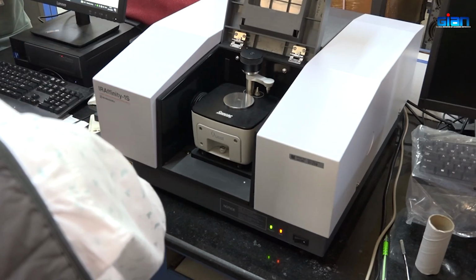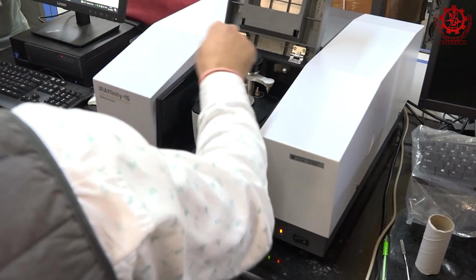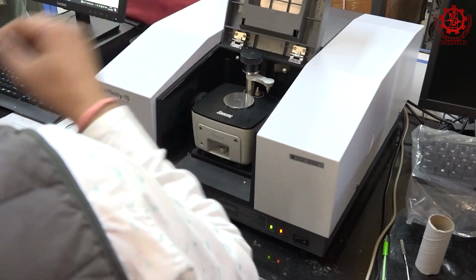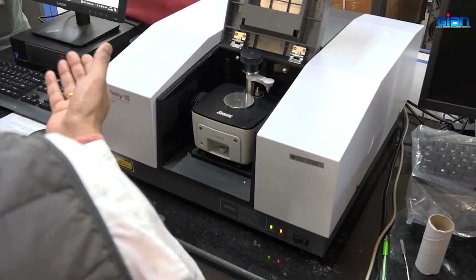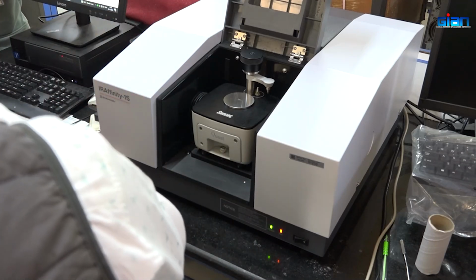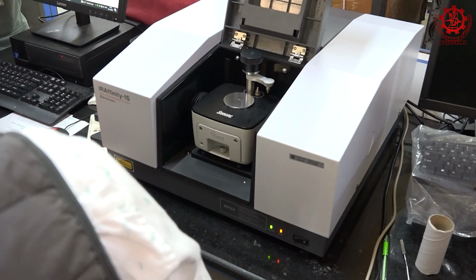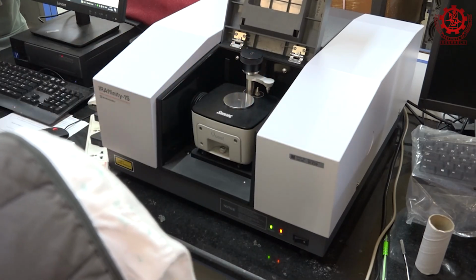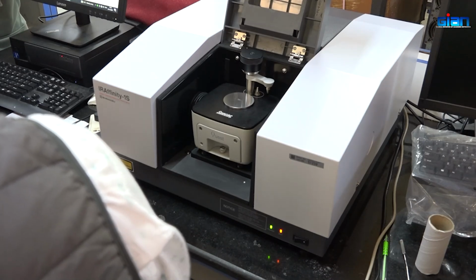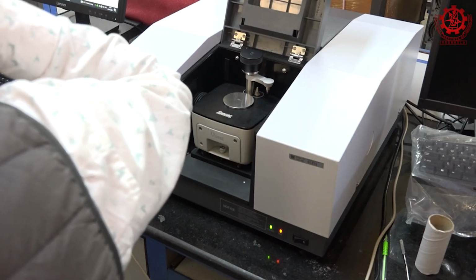Then after the blank scan, we will put our compound. First one we are doing in solution. So that means you make a solution, I told maybe 1 milligram in 100 microliter or something. So that solution, just take a drop and put on that place here. When we put it there, you let it evaporate, because otherwise almost all solvents are IR active. So that solvent peak will come there.